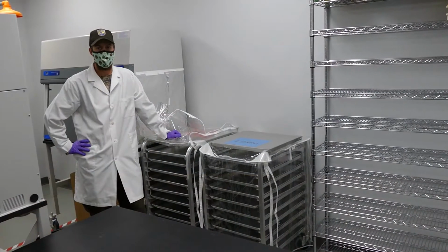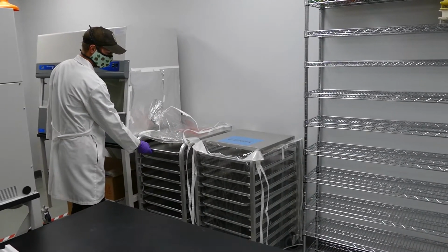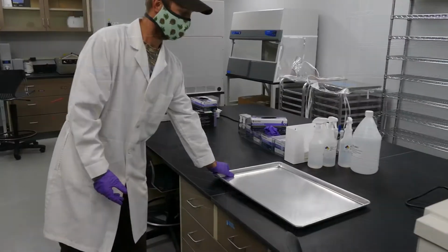While the samples are being centrifuged, you should clean your workbench with DNA Away and set up a clean tray and a collection container for decanting.